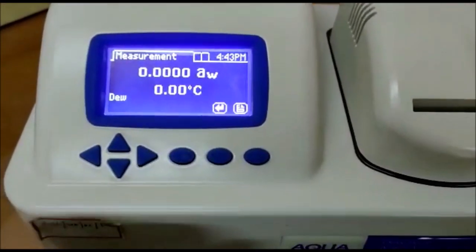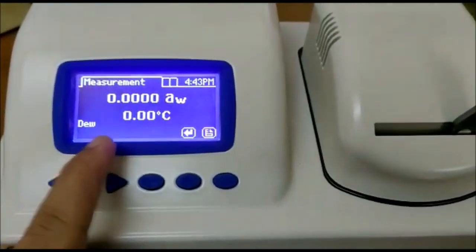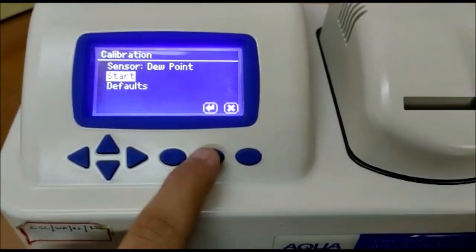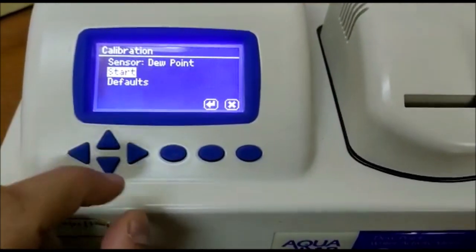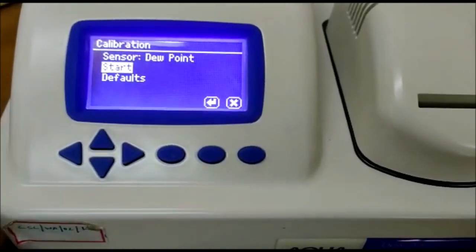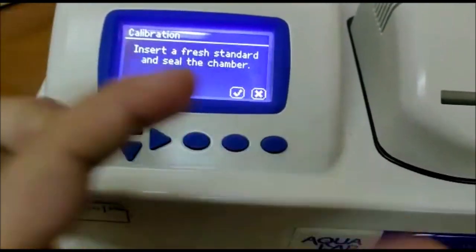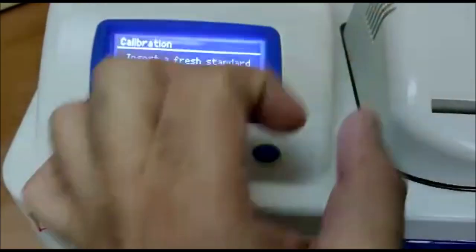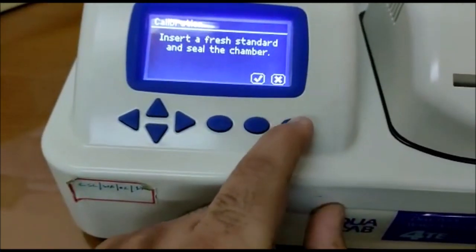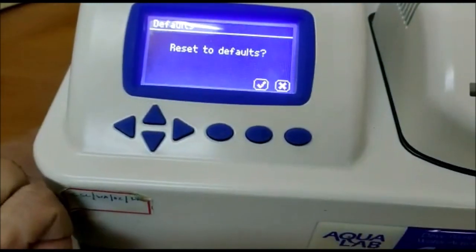Moving on to the instrument features. You can do calibration which can be done by two ways. You can either use the vials for calibration or you can set it to default. For vials you just have to insert the vial into the chamber and then start the test and it will read and you can change the offsets. And default will set the factory calibration.